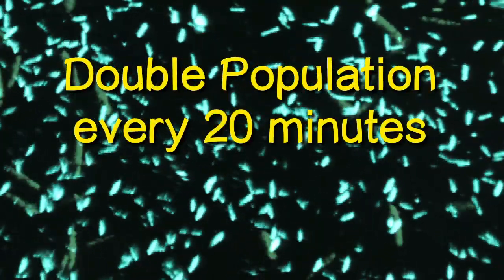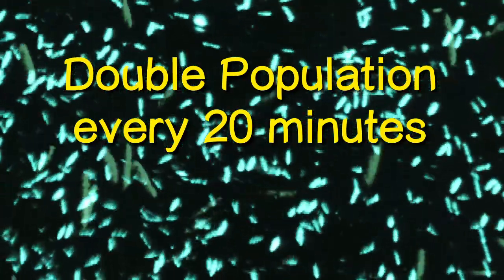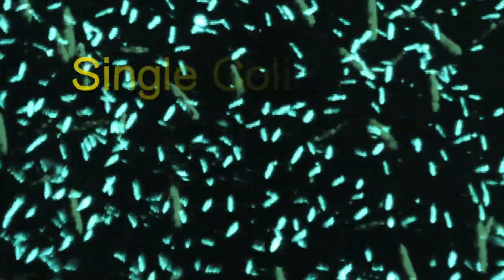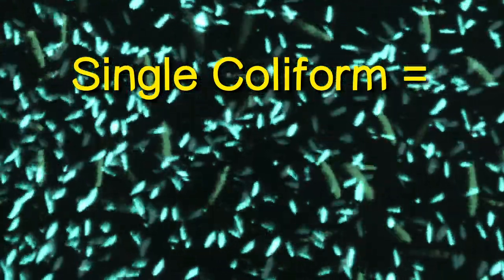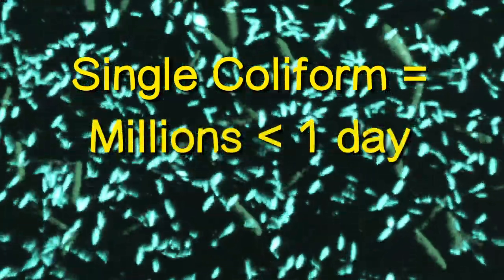In this environment, the bacteria will reproduce at a rate so as to double the population every 20 minutes. This means that a single coliform bacterium could give rise to a population of millions in less than a day.